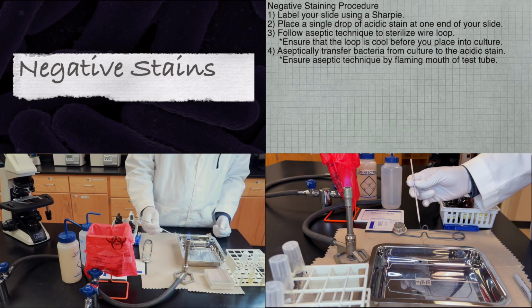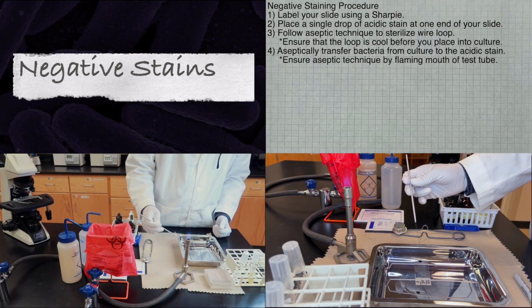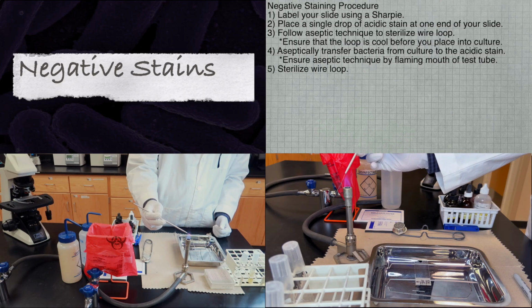When you transfer the bacteria into the stain, ensure you gently mix the two together. Then, please re-sterilize your wire loop.